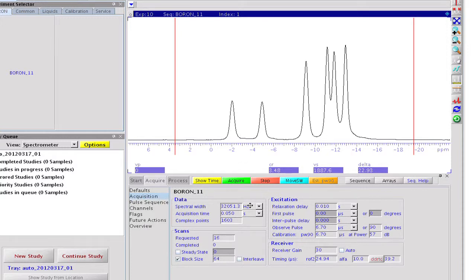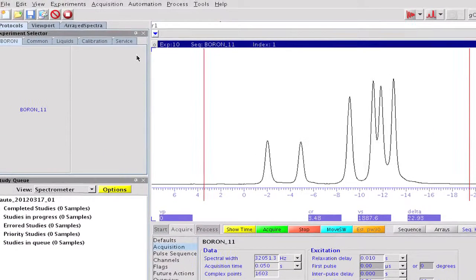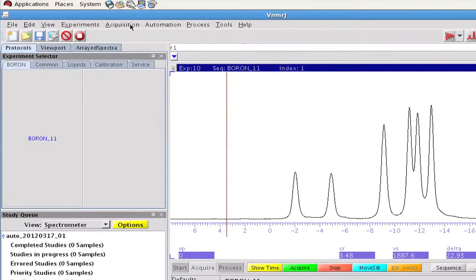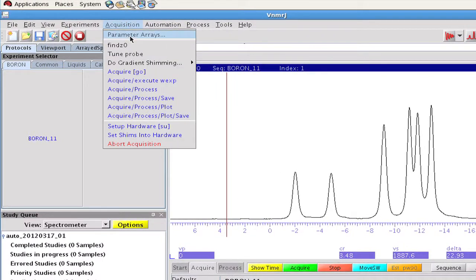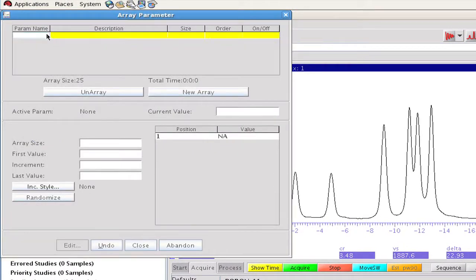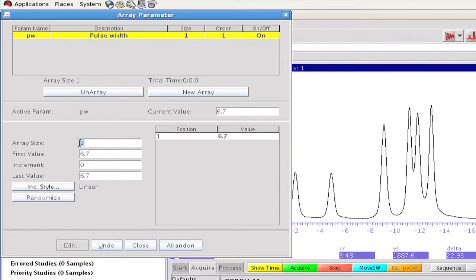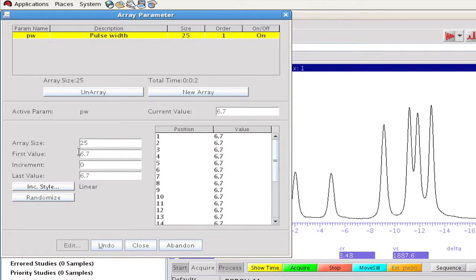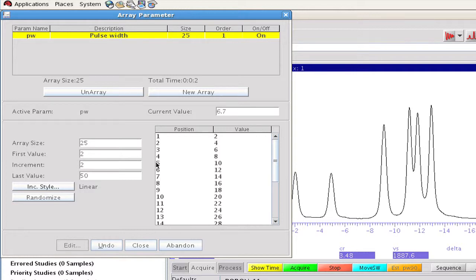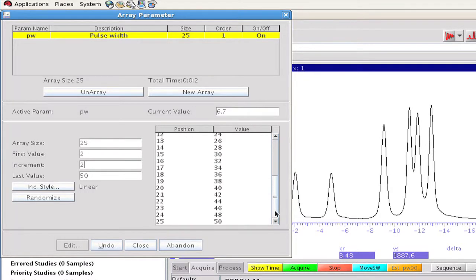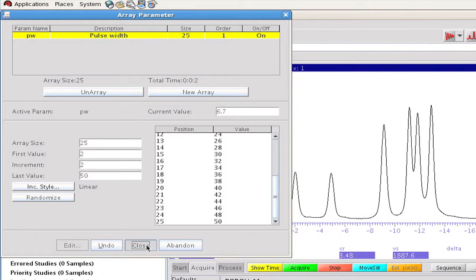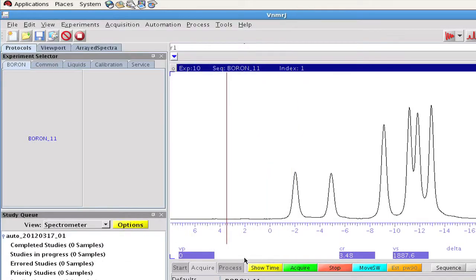The high boron sensitivity allows us to run the calibration with a single scan. We make use of the parameter array capability of VNMRJ. We request the PW parameter to be arrayed, asks for 25 values, starting from 2 microseconds and gradually incrementing it by the same amount. The result is a pulse width array from 2 to 50 microseconds. We close the window and acquire the data.